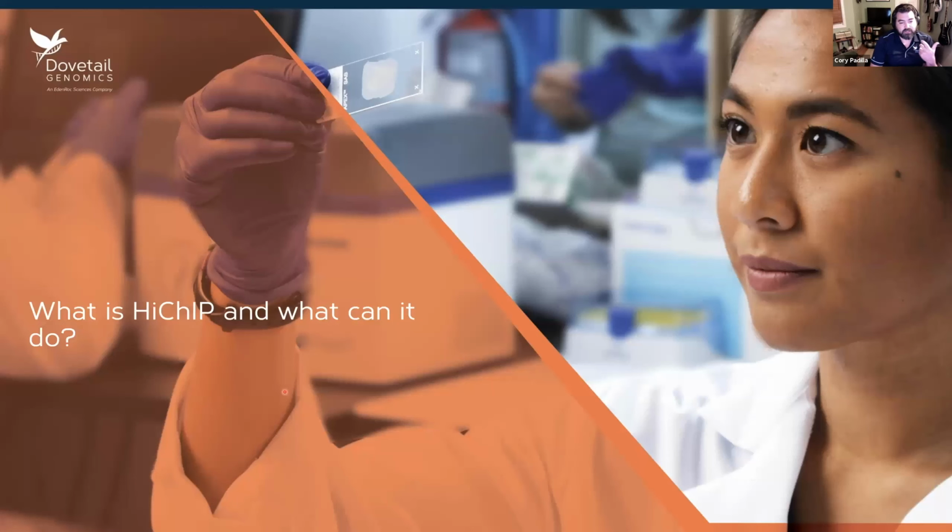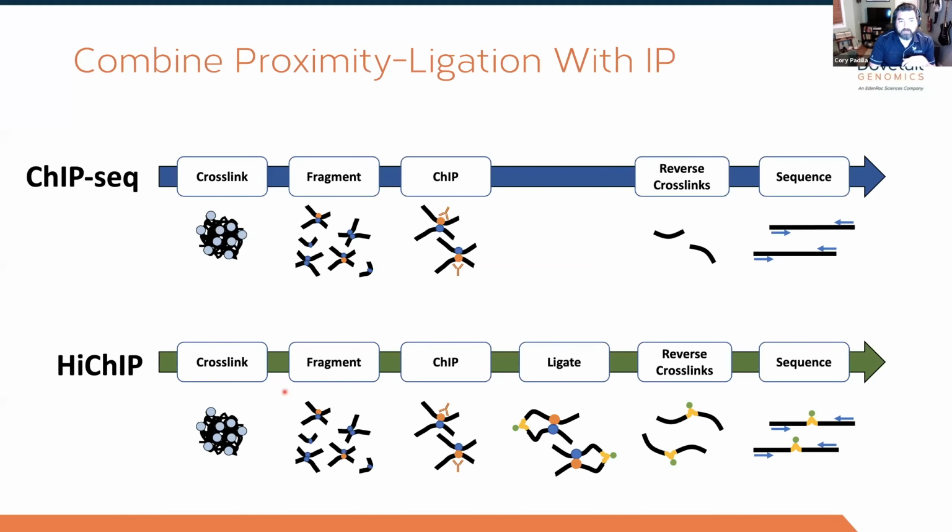So what is HiChIP and what can it do? Real briefly, here's the workflow for ChIP-seq. You cross-link your cells, you fragment, you do your chromatin immunoprecipitation, and then you reverse your crosslinks, purify the DNA, and convert that into a sequence library, and you're done.